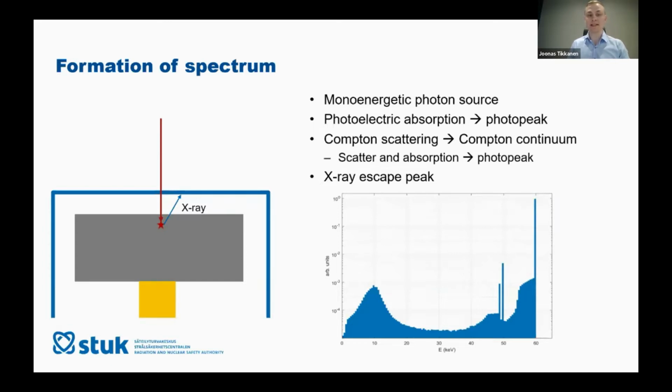But please note here that the y-axis is on logarithmic scale, so the photopeak really dominates the spectrum, but we do see counts on all the other energies also.